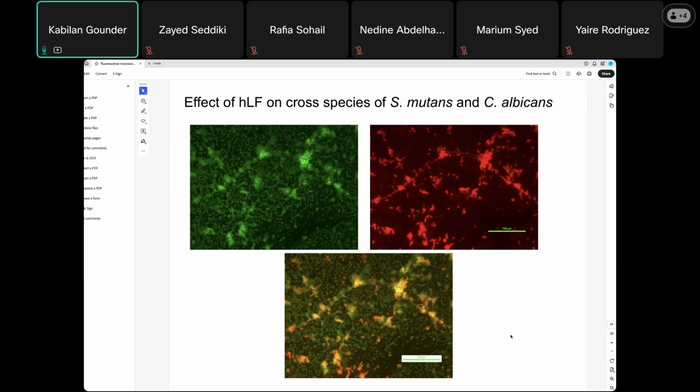And next week, we wanted to show 2 or 3 important slides on the Streptococcus mutans and Candida albicans study, and also different fluorophore functions that we are able to study, and how a fluorescence microscope helps to understand different diseases, as already discussed, and insight into hybridization and more.